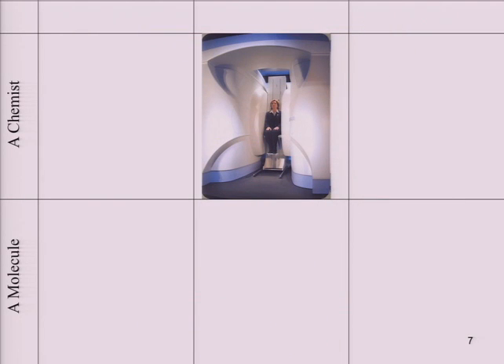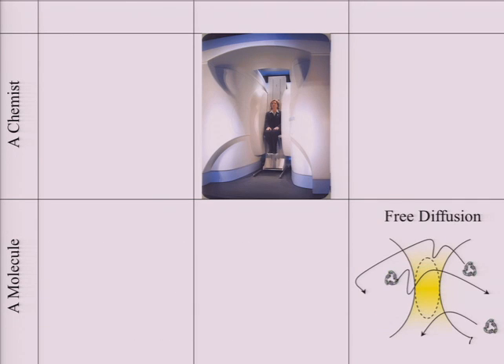And it would be nice to find an analogy to this for looking at a single molecule. One common approach, and WE introduced this earlier, for looking at single molecules in solution is to take a laser and a lens, a very powerful lens, a microscope objective, and form a very tightly focused excitation spot in solution, and one can sort of wait for molecules to haphazardly diffuse through it. The problem with this approach is that you only get a couple milliseconds of viewing time, and it's passing through an inhomogeneous excitation volume.